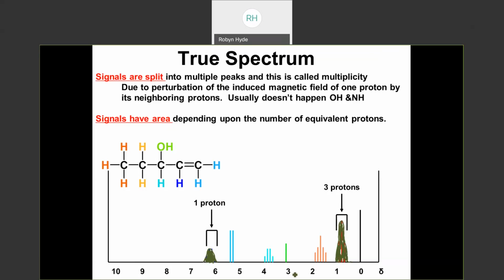So we're going to go back to the old days, because yes, I am absolutely old. In the old days, when I did NMR, I had to print 2 copies. So copy number 1, I would draw for myself pretty carefully these lines, and then I would cut out the shape, and then I would mass the shape. So let's say, I'm trying to keep numbers like whole numbers for us to do easy math in our heads.